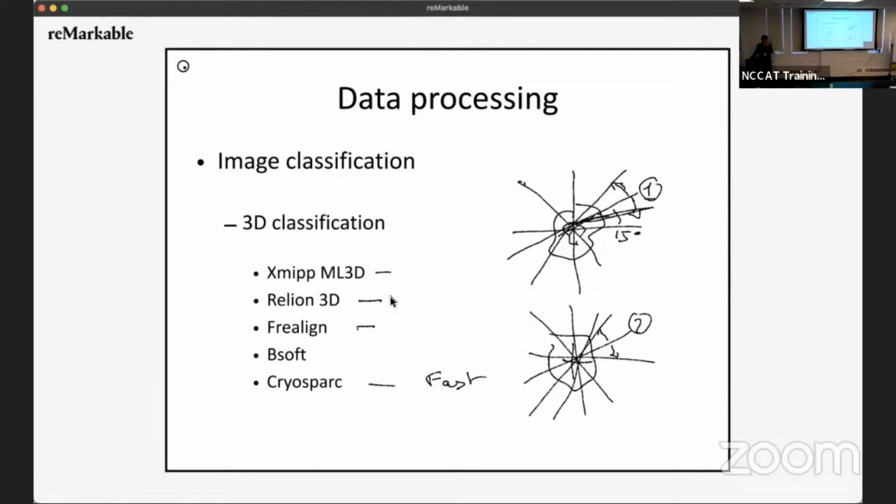And so that's a very important parameter in any classification, both in CryoSPARC and in RELION. What you're looking at in CryoSPARC or RELION is the resolution you use to align the particles. So it's the max align res parameter, or max expectation resolution in RELION. You want to set that to a bunch of different resolutions and do different classifications at those different resolutions and see what the result is for each of them, because the result will be quite different.